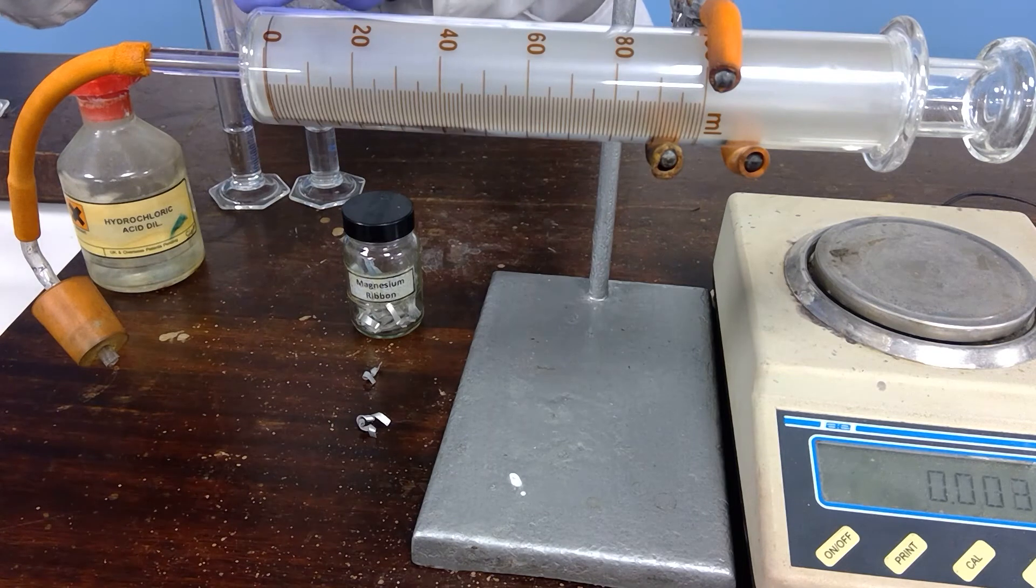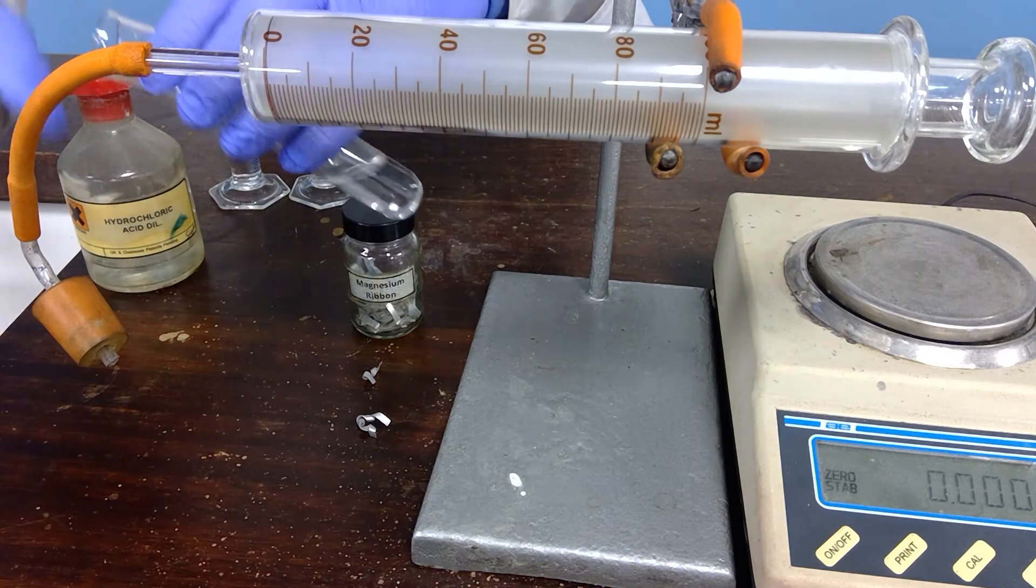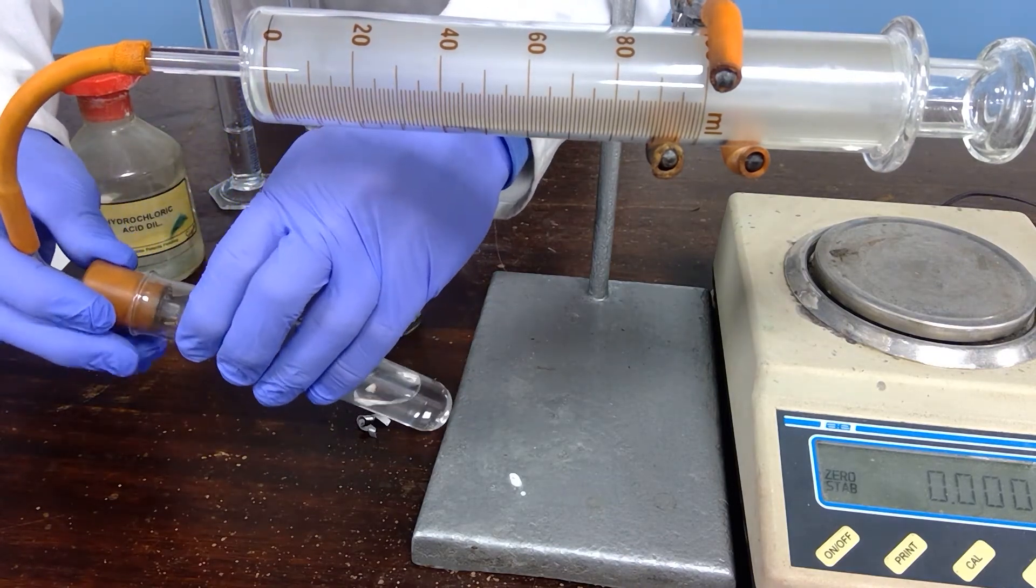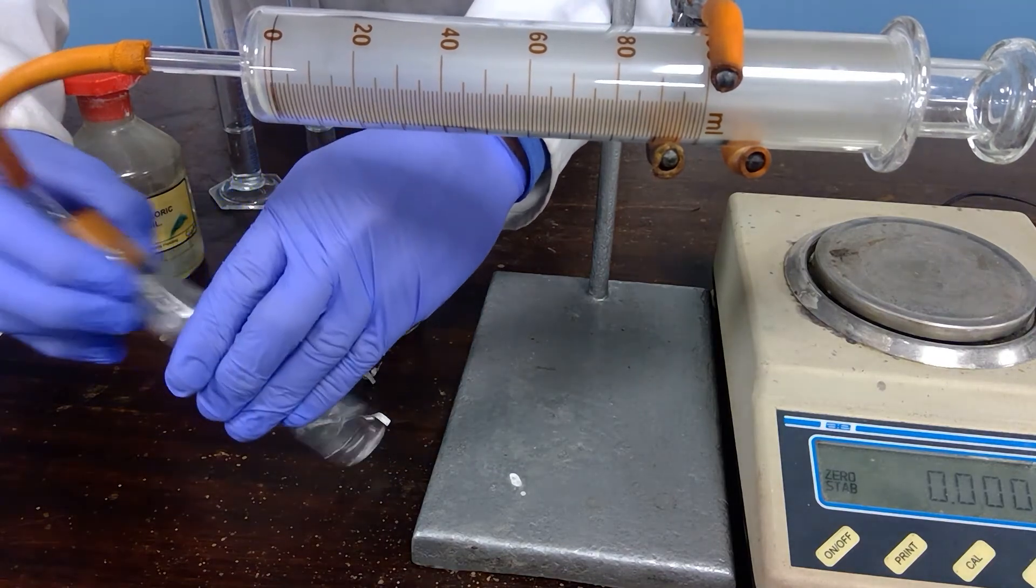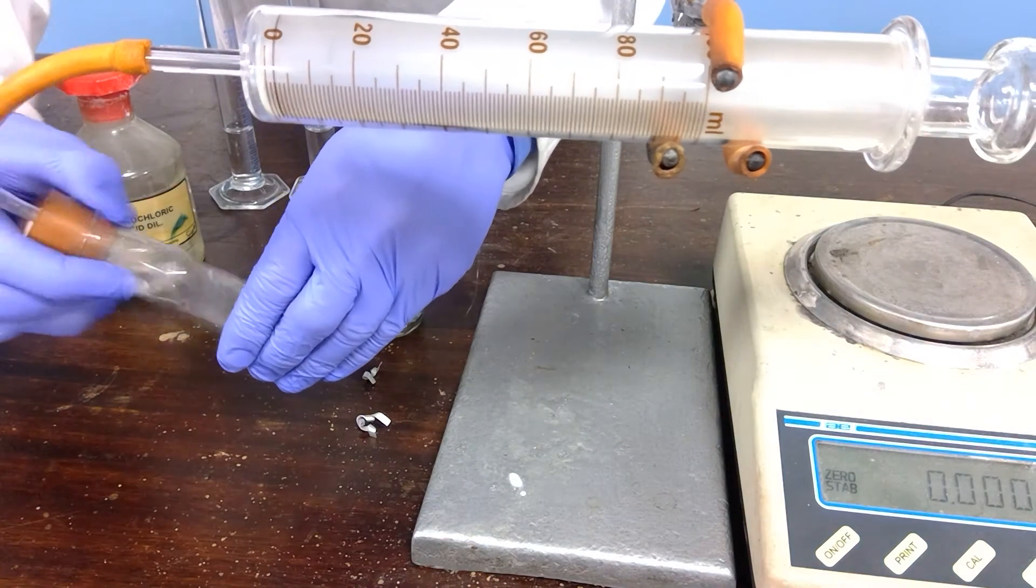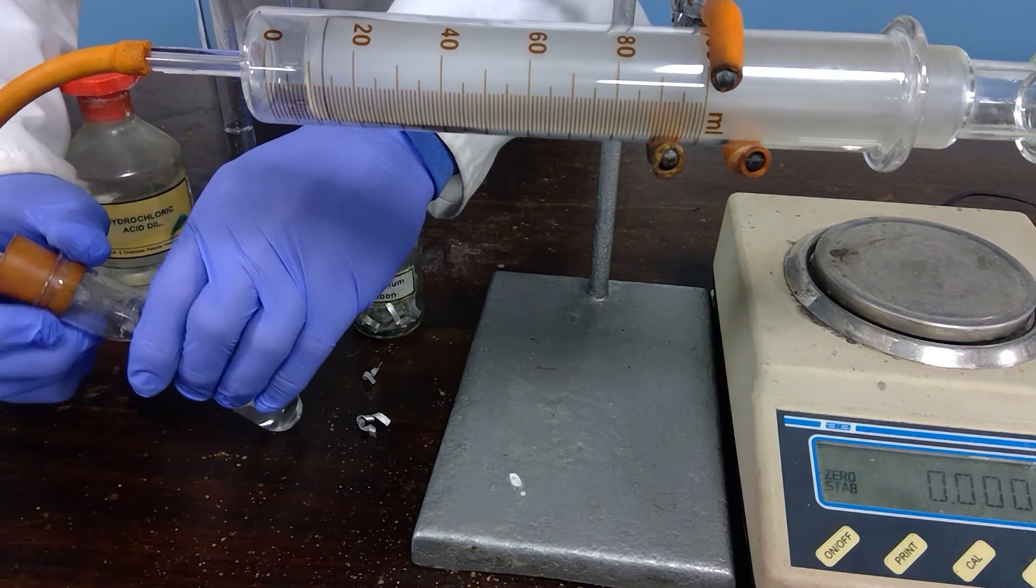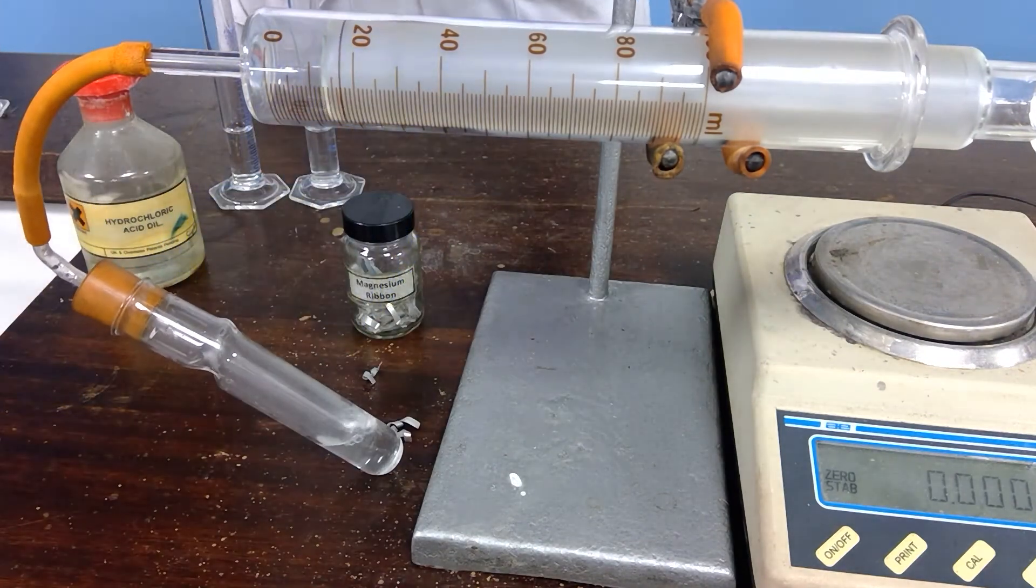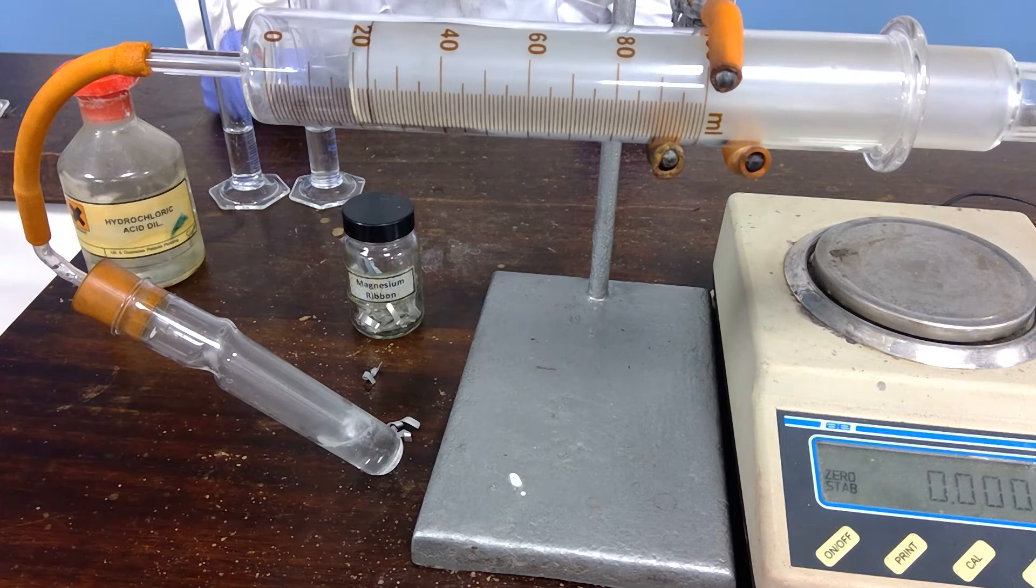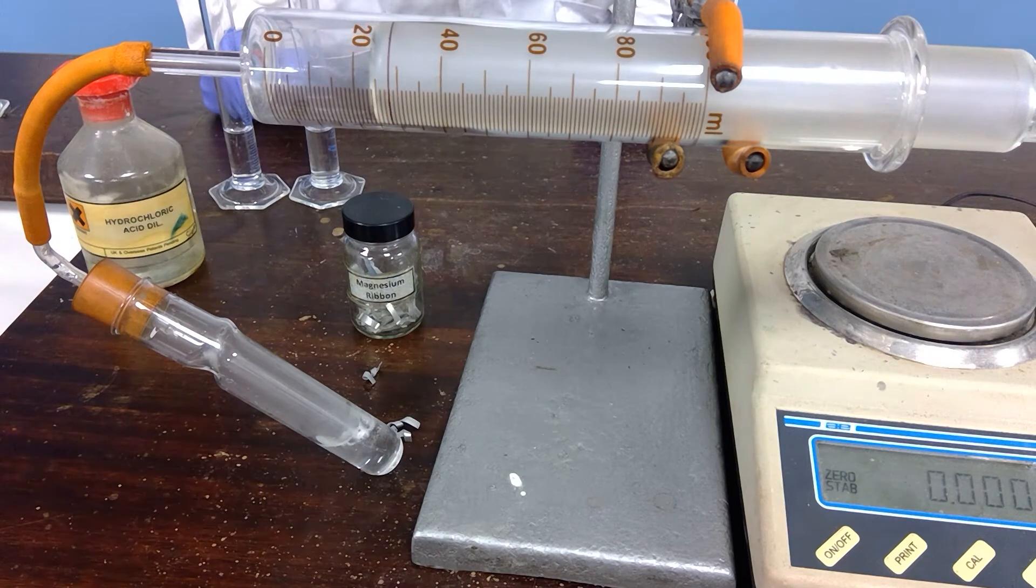I will place that into the upper compartment, make sure this is at zero, push the bung on firmly, and encourage the magnesium to fall to the bottom of the tube, which is done, and see what volume of hydrogen gas is produced. As you can see, the magnesium is reacting quite quickly with the hydrochloric acid.